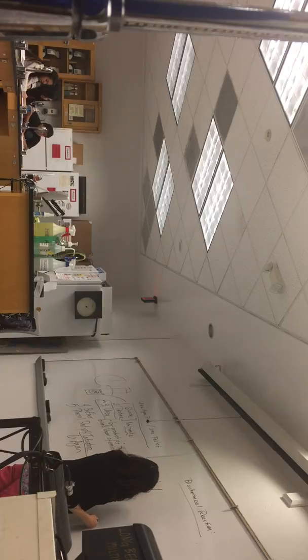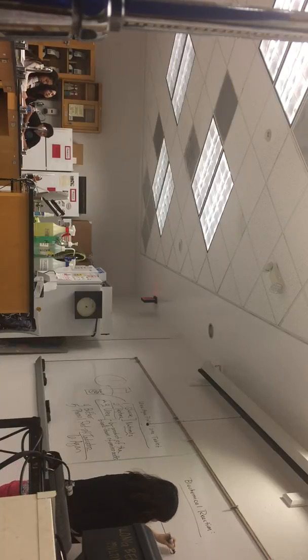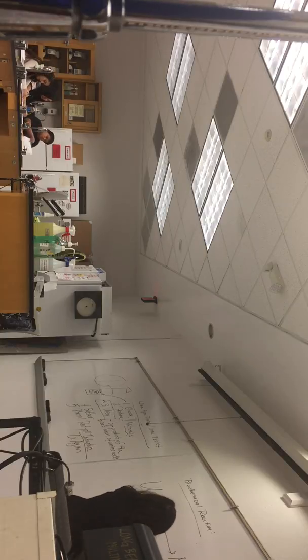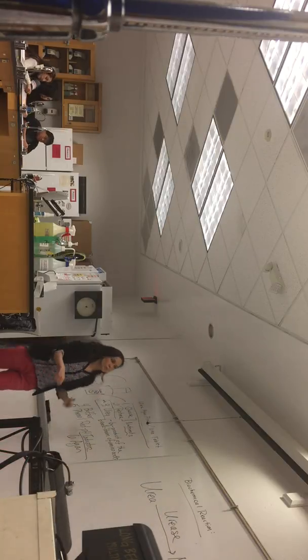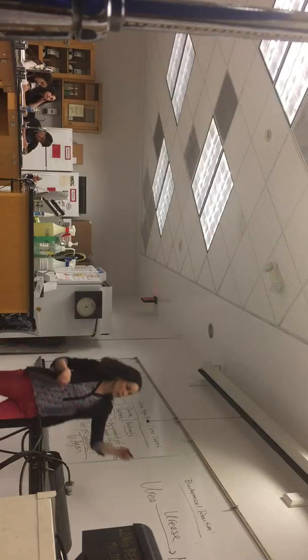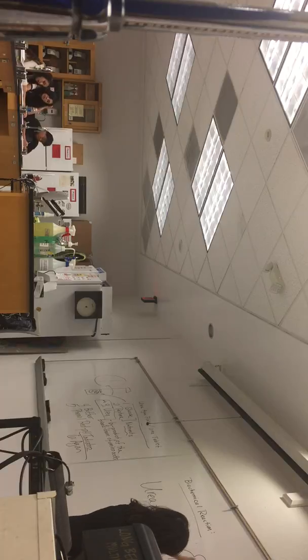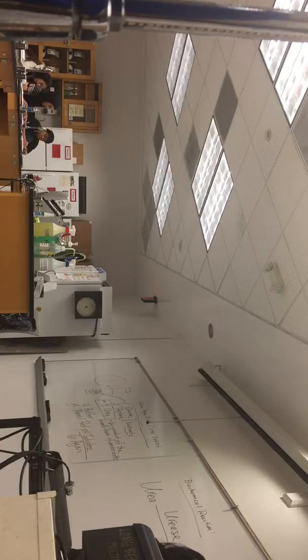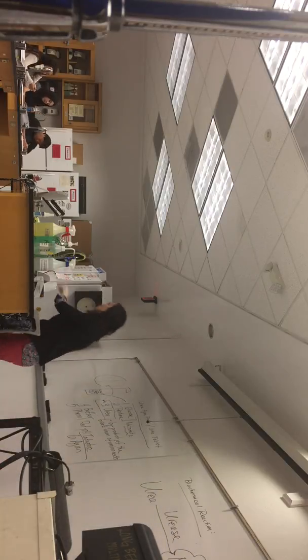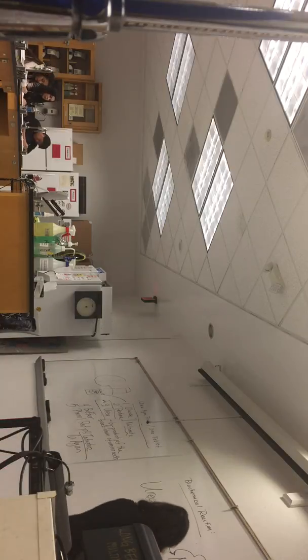We said though urea gets broken down into ammonia and carbon dioxide gas. Most organisms are pretty strong urease producers, but some do it a little bit slower. We're only going to look for this end product, ammonia. And what's really nice is we have a pH indicator in there that we've used already. So phenol red is the pH indicator.